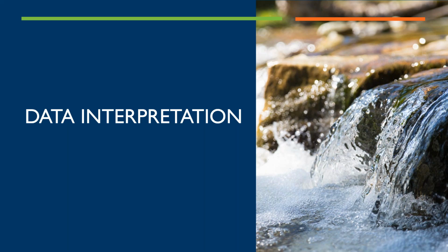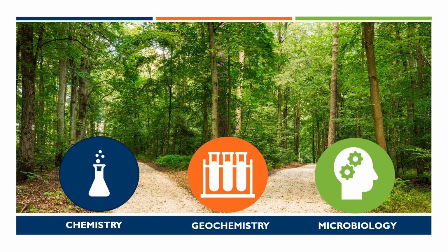Now I'm going to share some approaches for data interpretation that I hope you'll find to be sensible and accessible. I want to encourage you that you don't have to be a microbiologist to start making sense of your microbial results. As Sam mentioned, at Microbial Insights, we always advocate a multiple lines of evidence approach, integrating your microbial results with site chemistry and geochemistry in order to see the big picture of what's going on at the site.